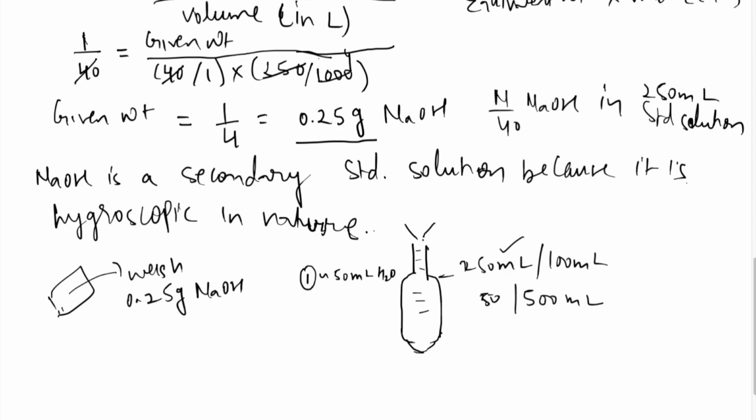Of course, you add water or any salt with the help of a funnel. So add a little bit of water first, around 50 ml, but you need not weigh it accurately. Then add the 0.25 gram of NaOH. Of course, while transferring, some pellets will remain stuck to the side, so you can add further water to dissolve them. In the flask you will have a mixture of water and NaOH.